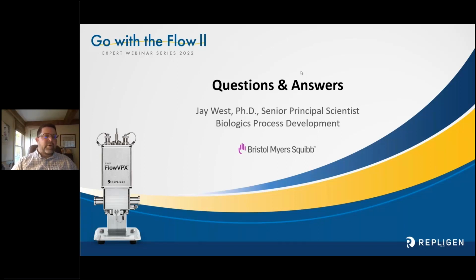We did a qualification of this method with the VPX, using the adapter, which would mix it at line, and inline, and it passed both. Like I said, the most critical part we were looking for was that 5% comparability across a wide range of different concentrations, a very large dynamic range.